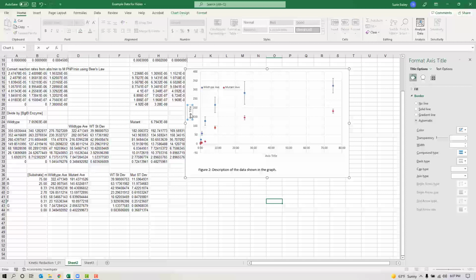So these are, let me select, average reaction rates, and the units on that are going to be molarity of PNP per minute per molarity of enzyme, right? Likewise down here, this is going to be my substrate concentration. So substrate, PNPG concentration, and the units on that are millimolarity, and now we're done.